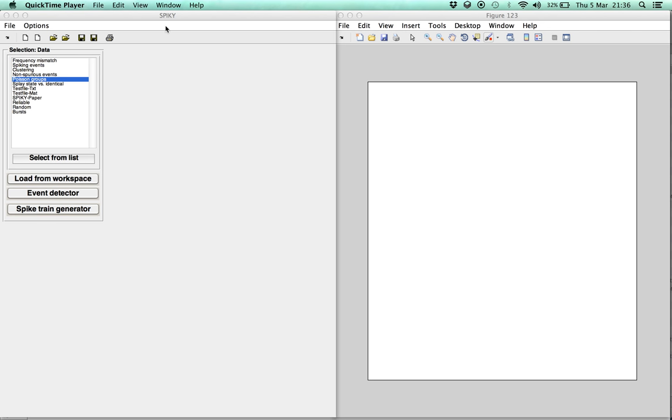Hi there! Welcome again to Spiky, the MATLAB-based graphical user interface for monitoring spike train synchrony.